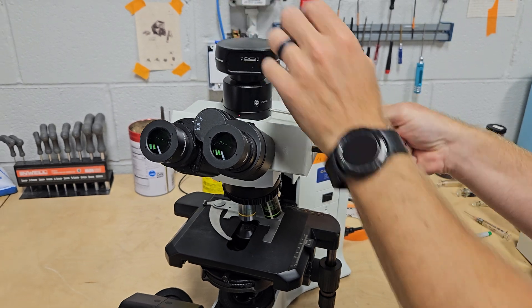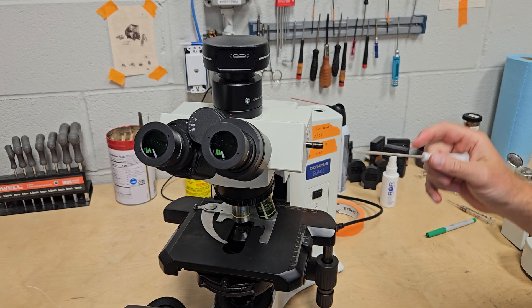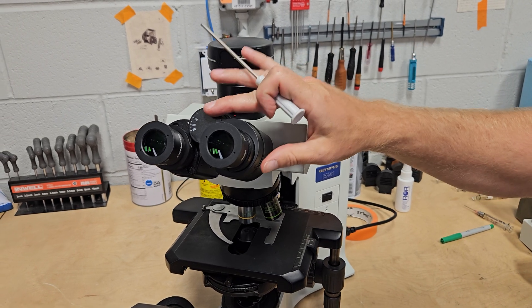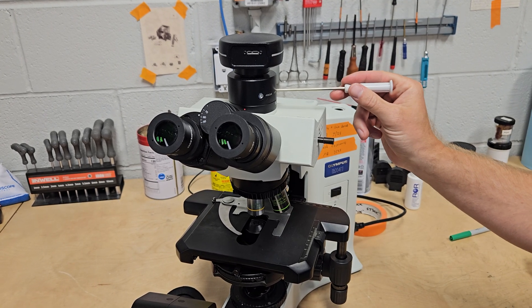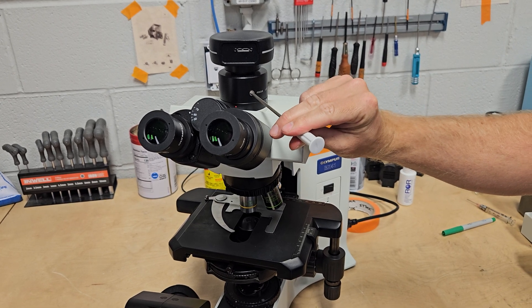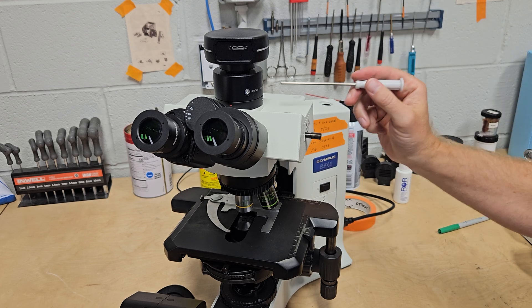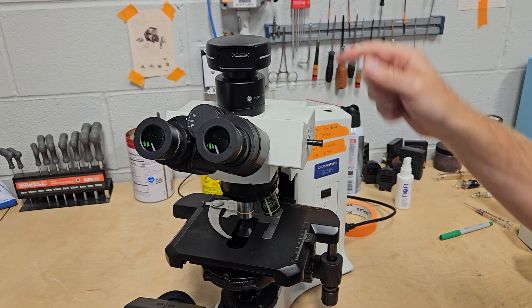What this focus adjustment is used for: when you bring the specimen into focus through the eyepieces, sometimes what you see on the camera doesn't match what you see through the eyepieces. The easy way to fix that is to bring the scope into focus by looking through the eyepieces, bring your camera image up on your screen, then back the lock off and rotate the focus ring while looking at the screen. Once it's in focus, lock it back in and your camera will be par focal with your eyepieces.